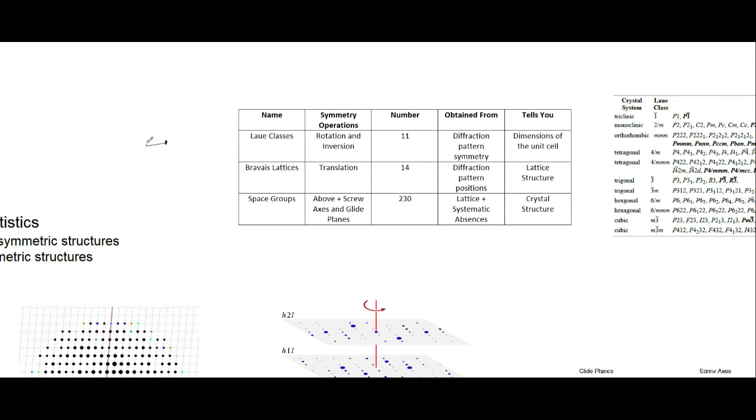So if we had something like this, then we know that that's rotational symmetry. We can rotate this 180 degrees and it gives us the same thing. It's inversion symmetric because you can invert this over to here, this over to here, and we get the same thing, but this is not moving, so it's centrosymmetric.